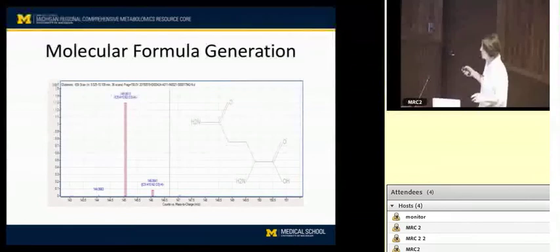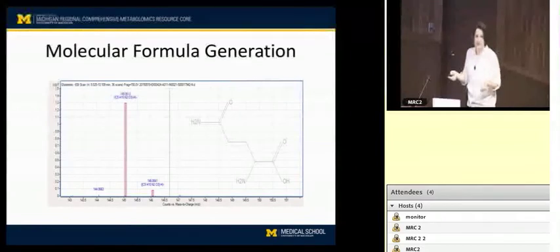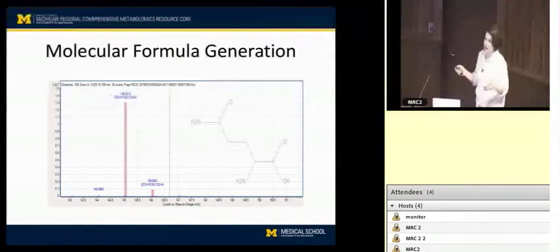The reason we don't do it routinely anymore is that once you start thinking about atoms that you're definitely going to see biologically, and the uncertainty as to how many copies of any atom might be in a particular formula, you start to get more errors. When you start adding phosphate and sulfate, which are definitely present in biological materials but which most of your compounds probably don't have, your chances of picking up an incorrect formula are greater.